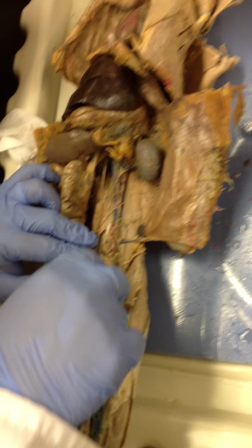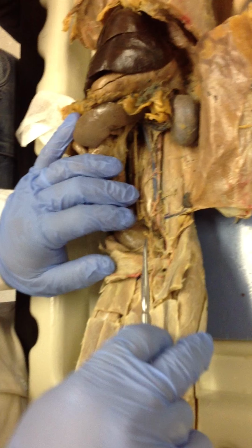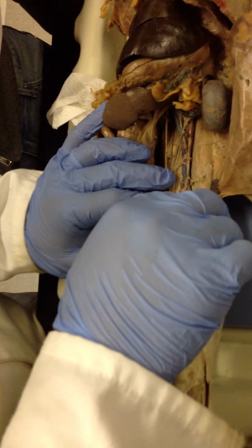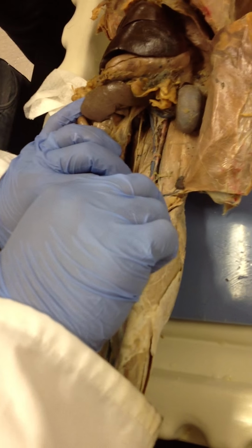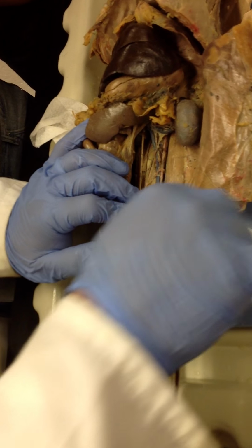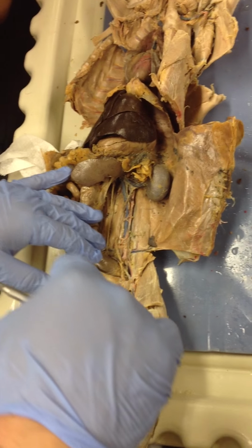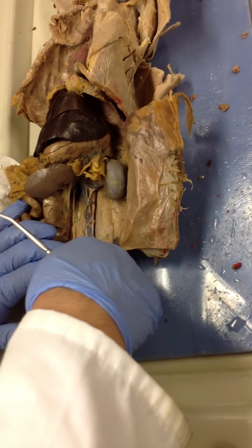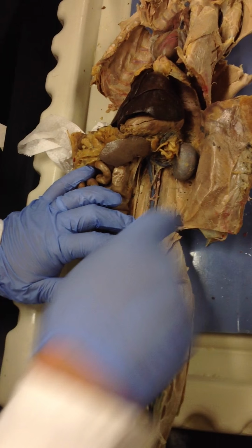For the veins, this one is still a little bit covered by connective tissue, so it becomes hard. But the common iliac veins are going to start where the inferior vena cava splits, which is up here somewhere. When it splits, you have your common iliac vein. And then there's going to be another split where the internal iliac goes deep, and the external iliac continues out and ultimately becomes the femoral.